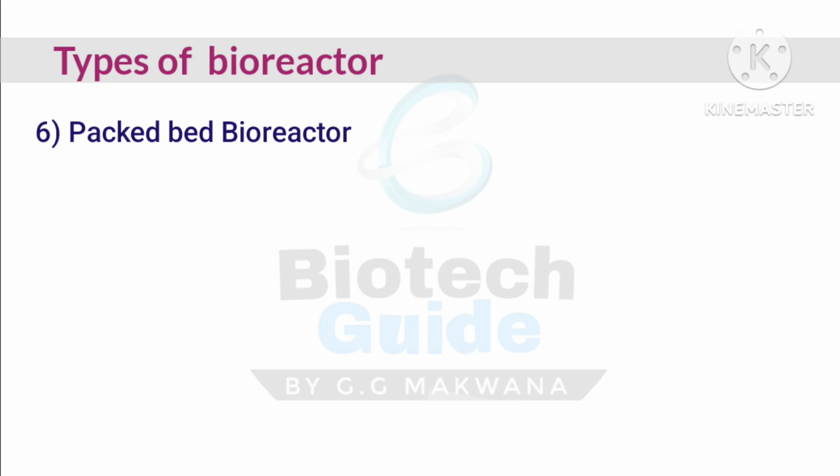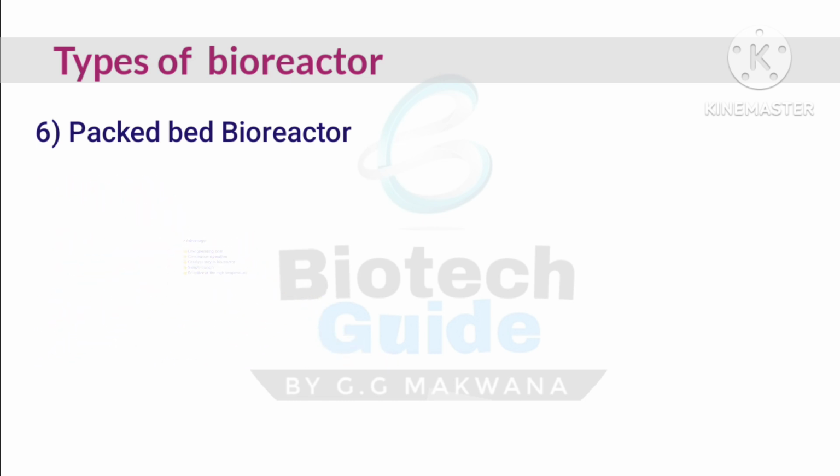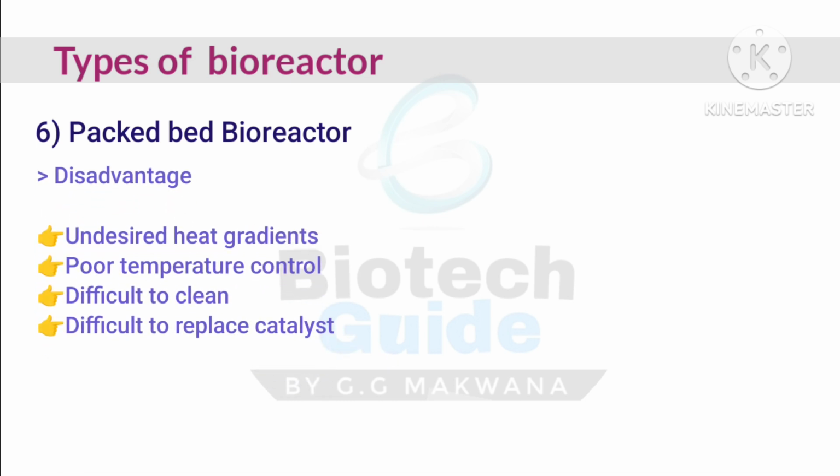Now the advantages and disadvantages. Low operating cost, continuous operation, catalyst stays in the bioreactor, simple design, and effective at high temperature. Those are all the advantages of this packed bed bioreactor, whereas undesired heat gradients, poor temperature control, difficult to clean, and difficult to replace the catalyst are the disadvantages of this packed bed bioreactor.